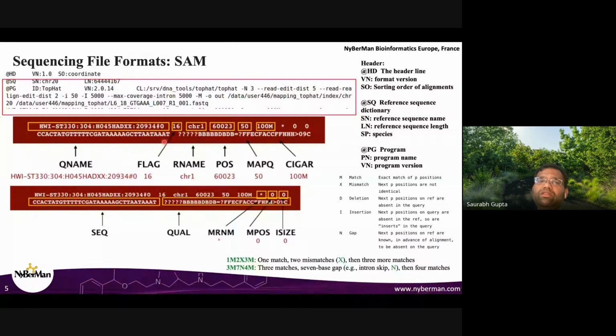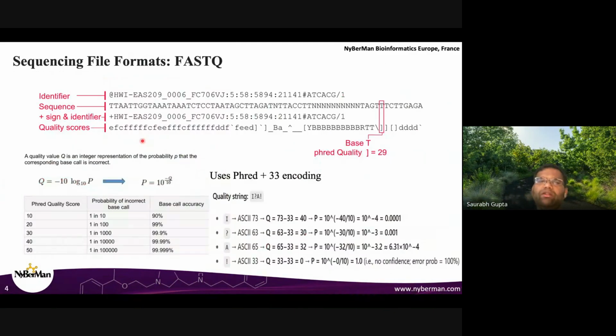The way that is calculated is based on the color intensity. If you have a bright red, you will have the highest quality, and if you have a bit of a dim red, so the intensity would be lower, then the sequencer will say, maybe the probability is red. This is the kind of intensity it uses to convert into your quality. Okay, clear?